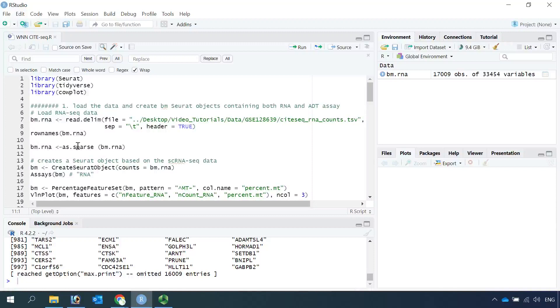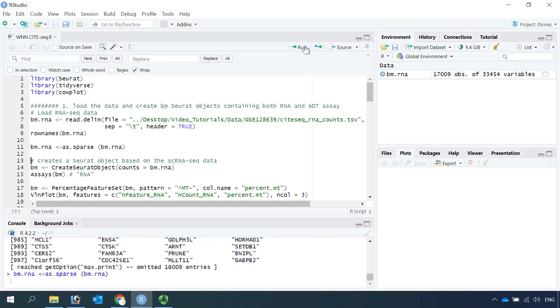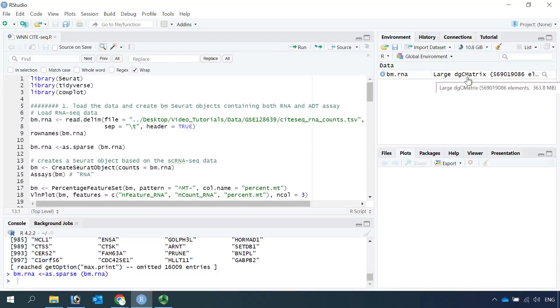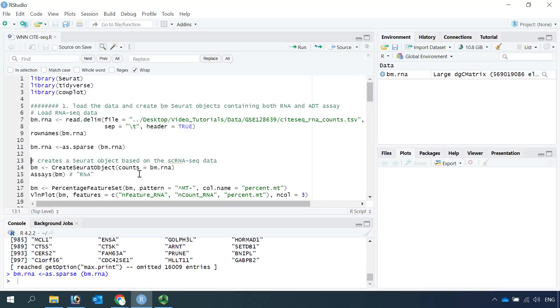Then we can change the data frame into matrix data. You can see we now have a large DGC matrix. We use the matrix data as a count to create a Seurat object, and we name it BM, meaning bone marrow.